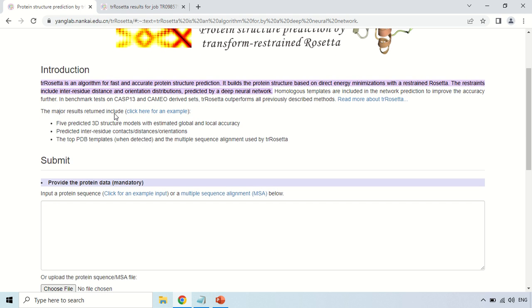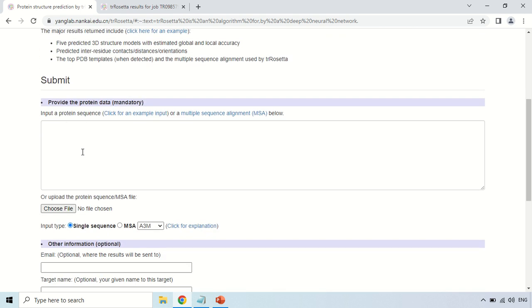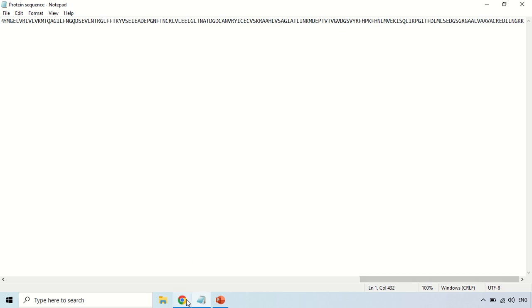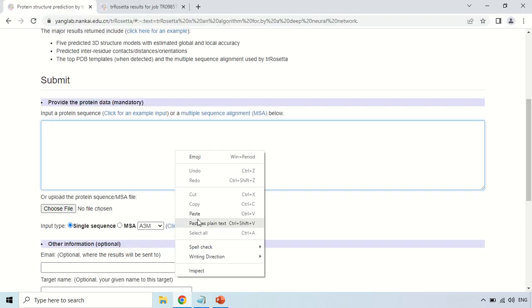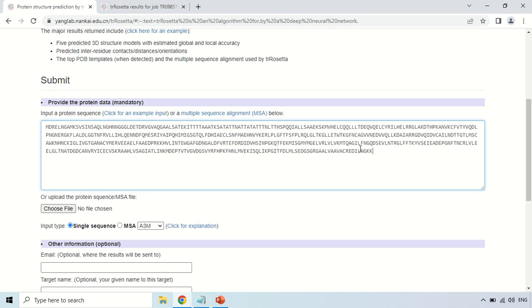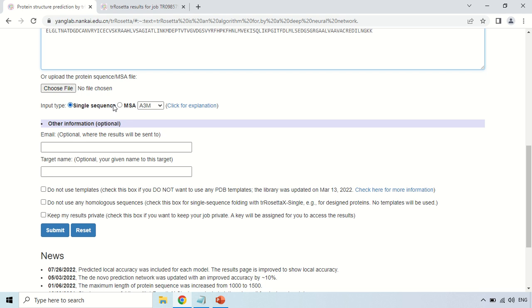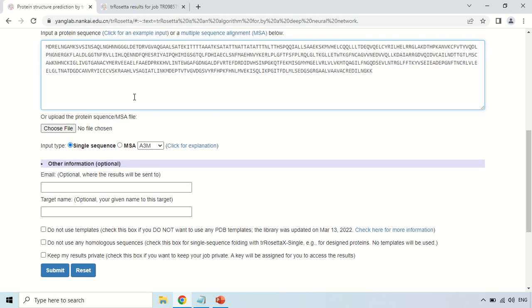As you scroll down to the submit section, you have to submit your sequence. For example, I have already downloaded a sequence — just copy that sequence, or use your own protein sequence, and paste it here. This is the sequence of the protein whose tertiary structure I want to predict. You can also choose a file if you don't want to copy and paste. For input type, since we are using a single sequence, select 'single.' If you have more than one sequence, you can choose 'multiple sequence alignment,' but here I am choosing single sequence.